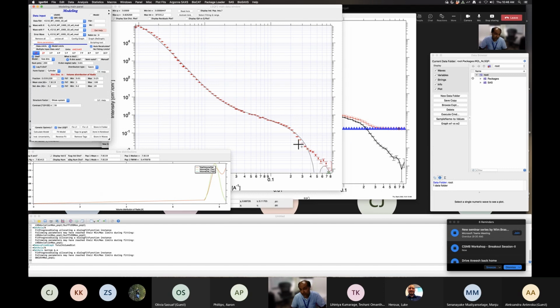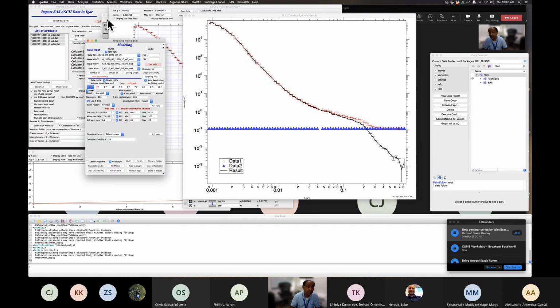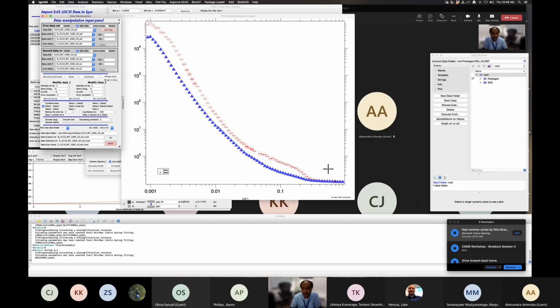That's because we probably have still some solvent there. So the other option is to keep subtracting. The other thing could be, oh, there may be some of the isotropic component, and that could also be giving rise to this. So let's first start. Then we go back to the subtraction, and we say, okay, let's try to subtract this with wedge 1, right? So if you do 1:1 subtract, and I'm going to call it modify 1 so I don't overlap with the previous data.